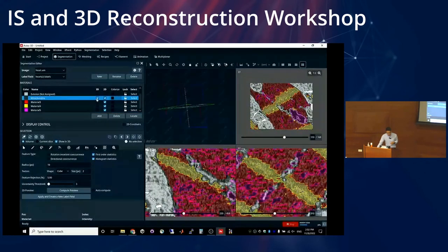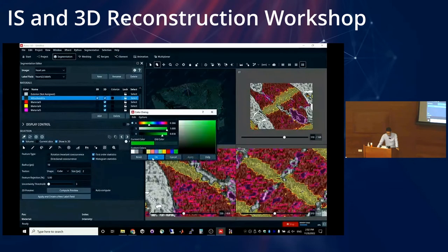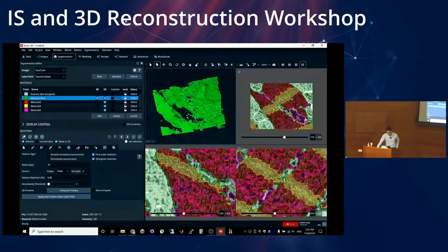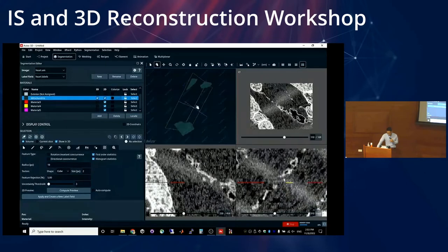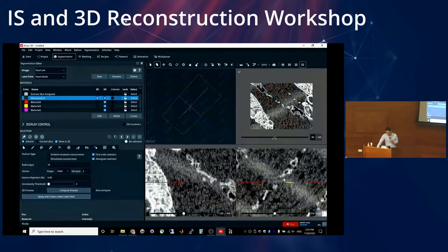So if I preview the mitochondria here, let me change the color. Yeah, it's really, really good in terms of that kind of texture. But for the others, it's not. And that's where I would go back and try to tweak the different parameters here. So I would go back again to my brush strokes. This is something I don't really like, but you always have to go back to that slice where you have your brush strokes. Otherwise, the preview will not work, okay?